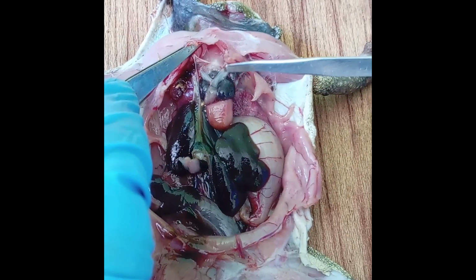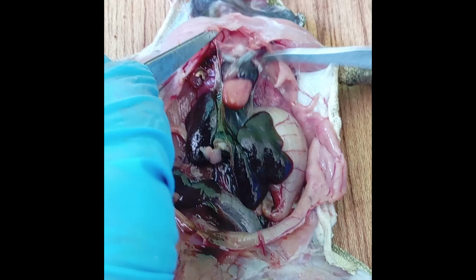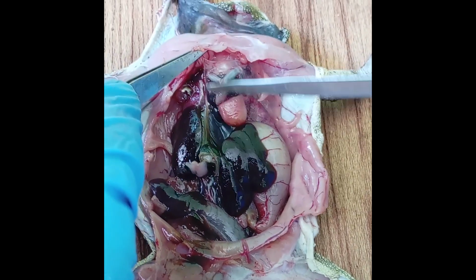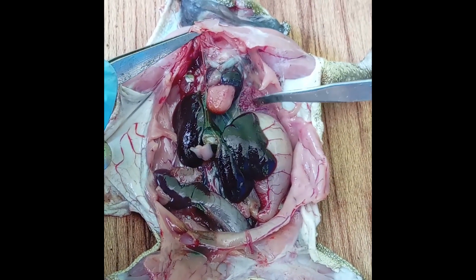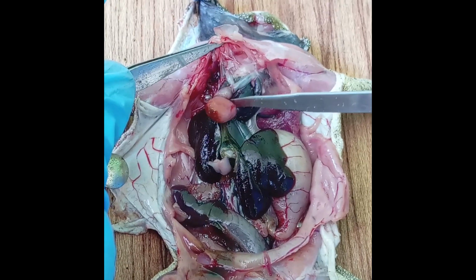You have the heart with its blood vessels. You can see the lung at the side there. You can see another lung. That's the thoracic area. That's a lung there. That's another lung. That's the heart. So that's the thoracic area.